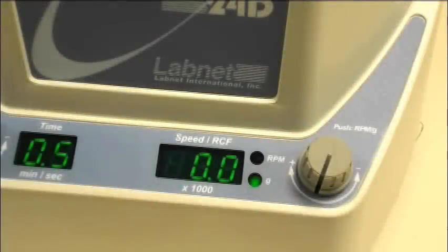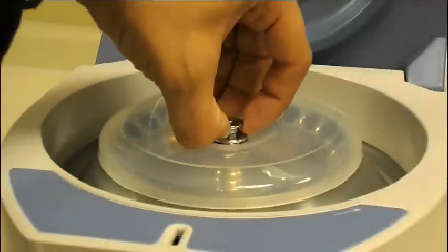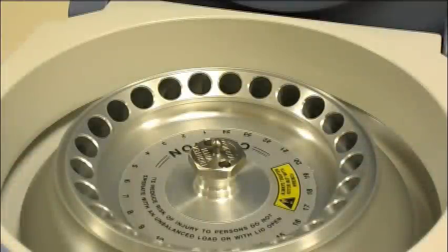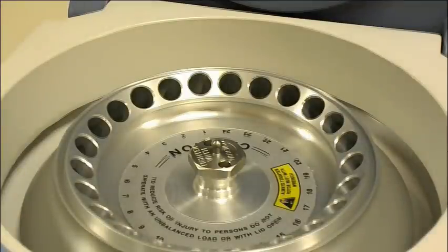What's also very unique about this instrument is the inclusion of a 24 by 1.5 or 2 milliliter angle rotor, which includes a lid and is surprisingly lightweight. Taking off the lid is as easy as just pulling up on this metal knob. This rotor can be equipped with a variety of adapters which can accept tubes from 0.2 milliliters all the way up to 0.6 milliliters. The rotor can even accept LabNet's unique strip spin adapter, which allows it to spin 0.2 milliliter strip tubes.